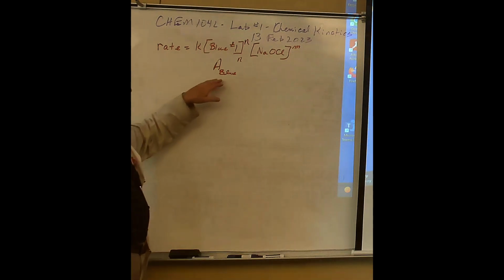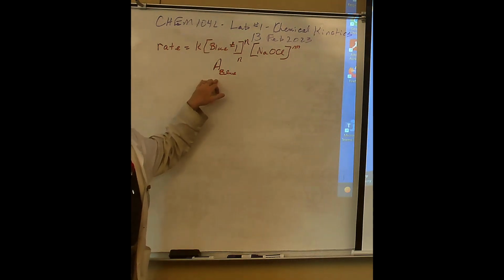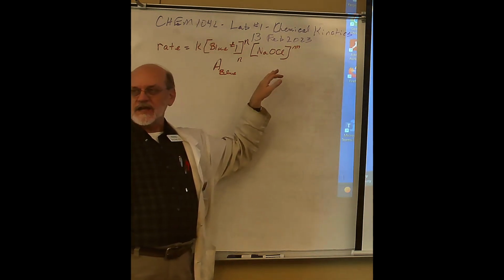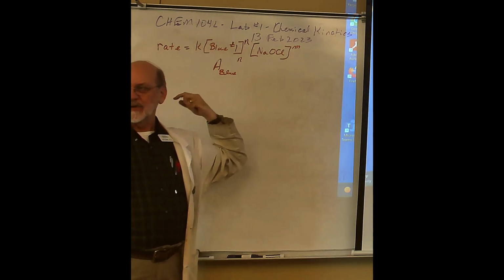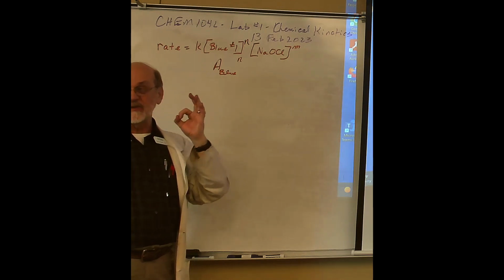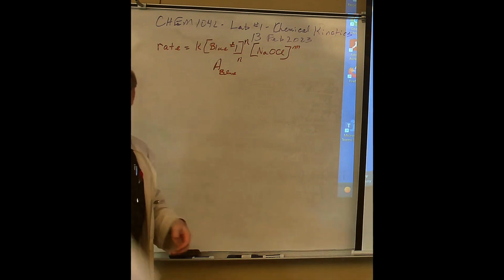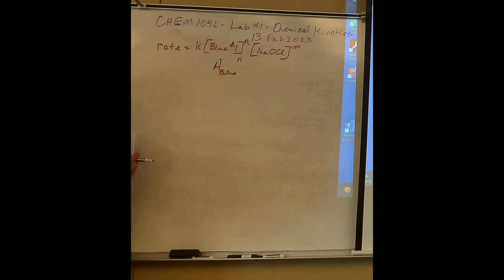And that's one of the reasons that we use a blue dye, because once it's been destroyed by the bleach molecule, the chances of the products coming back to be a blue dye are almost zero. So we've got an initial rates all the way to the end.